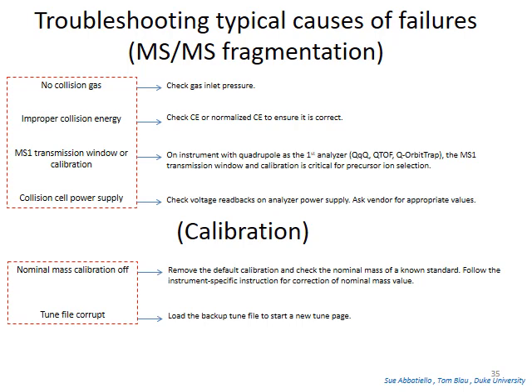Collision gas is supplied by high purity nitrogen, usually in a separate cylinder. Ensure sufficient collision gas is present. Sometimes the settings of collision energy are improper. You may check these settings to ensure they are correct.